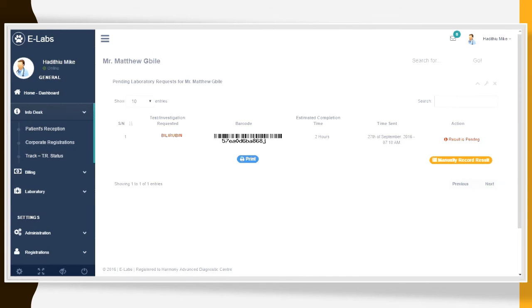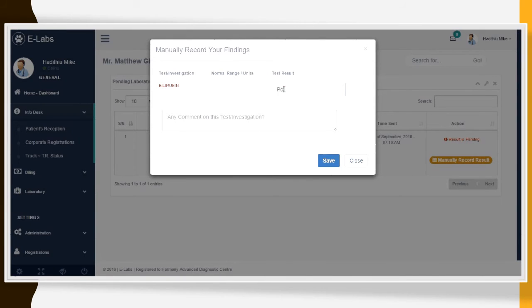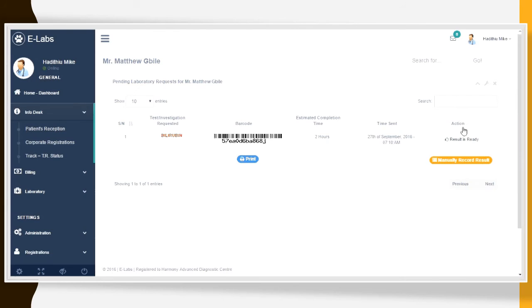So let's go back here, okay, and let's finish this. So I will say this is positive. And comments, I want to put a comment from here. Okay, I want to say prescribe a new dose of tablets. So I'm going to save, and then the result is ready.